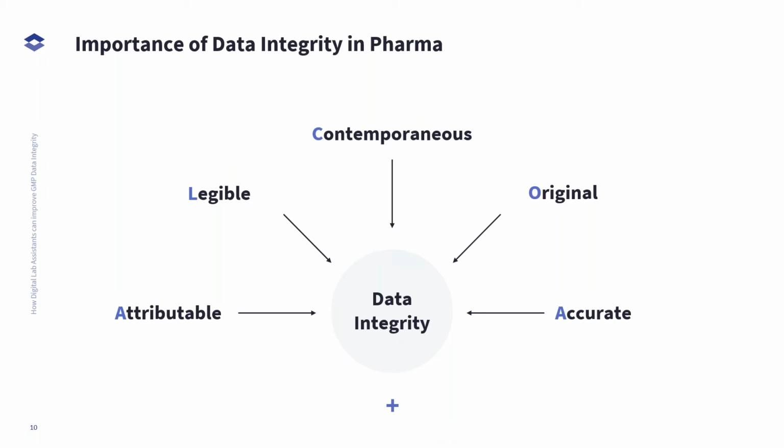And then we go over to original. So the data has to be preserved in an unaltered state. And here I also have a very nice example from nowadays from computerized systems.